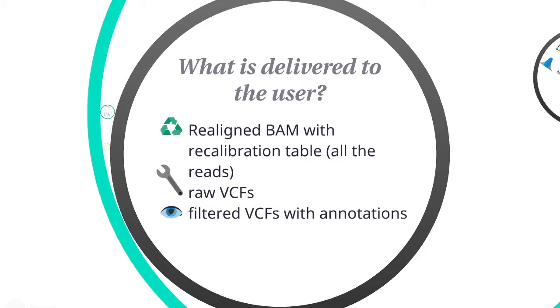It means that if you want to recalibrate it again, you have to do it yourself, but it is saving a lot of space. We are providing all the raw VCFs that are generated by the variant callers, and the filtered variant calls with annotations.